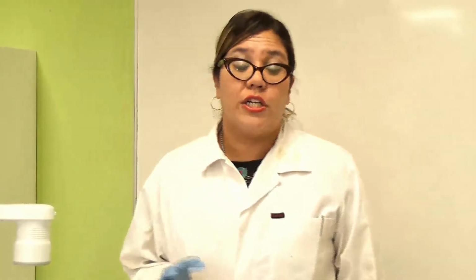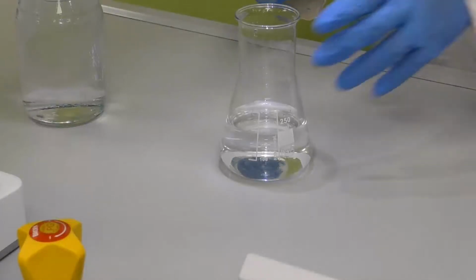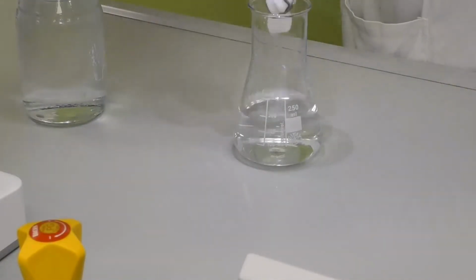One of the experiments that I like to play with is dry ice. Now, before we say dry ice, you mean ice which you dried with a hair dryer? No, not really. Dry ice is basically solid carbon dioxide, and I'm going to pull it out. I'm pulling it out with tweezers because it's really, really cold. It is at minus 78 degrees Celsius.